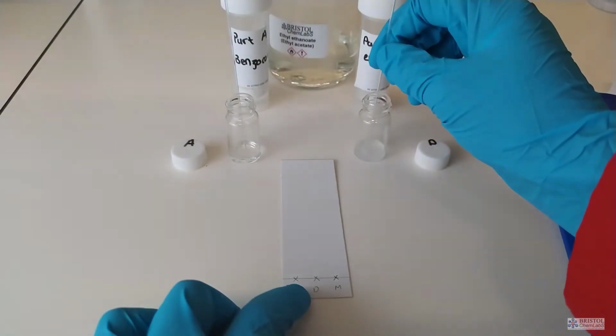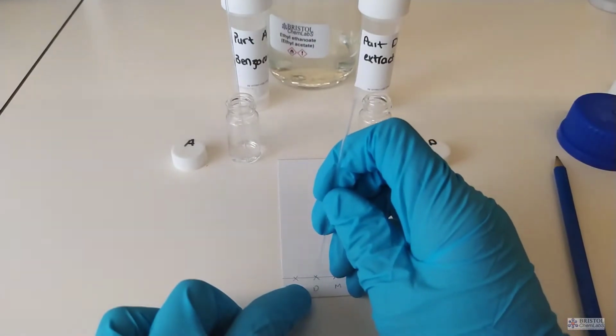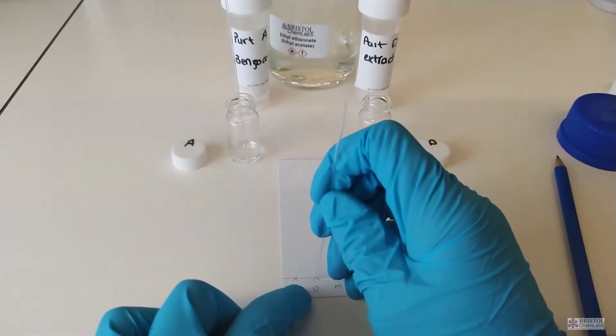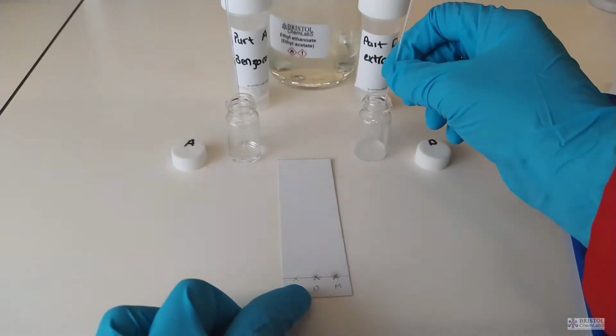Before we run the TLC, we put the plate under an ultraviolet light. Because the sample applied has covered over the fluorescer, it appears as a dark spot against a green fluorescing background. You can also check there are no impurities elsewhere on the plate at this point.